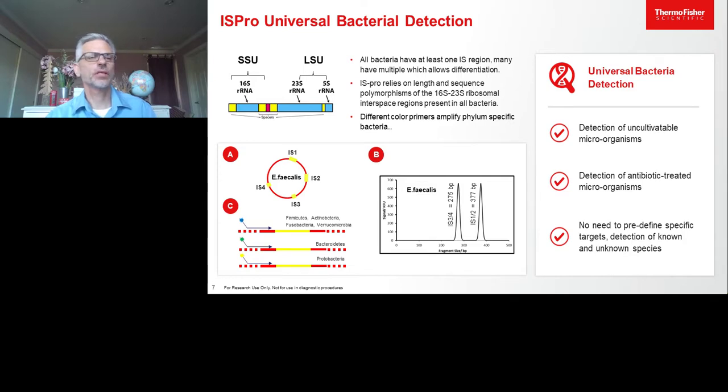Our colleagues at InBiome have used this approach to examine microbiota in nasopharyngeal swabs collected from individuals that have been infected with SARS-CoV-2. They have used this technique to identify specific microbiota profiles that may be correlated to the likelihood of infection of the virus.